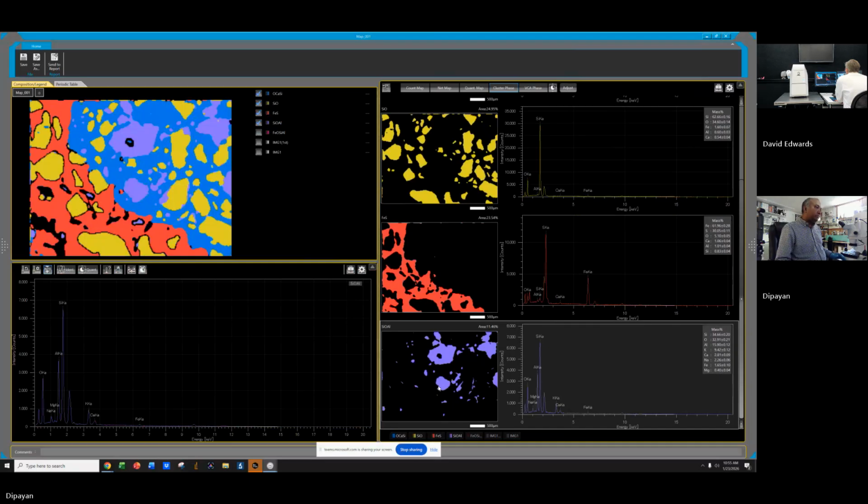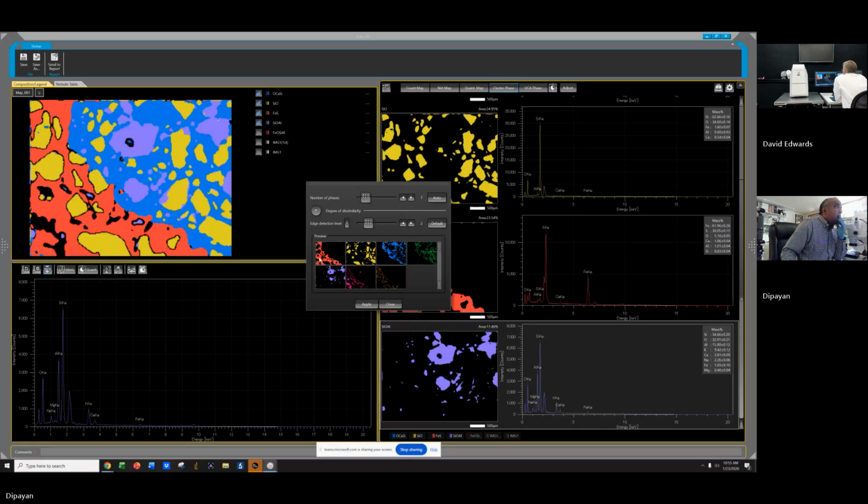I mean, you just tell me if I'm in the right direction here in my thought process. Yeah. So go ahead and open up Adjust again. Right. So that one creates more phases. You get an edge detection, so some of the edges can be reduced by playing with the edge detection.